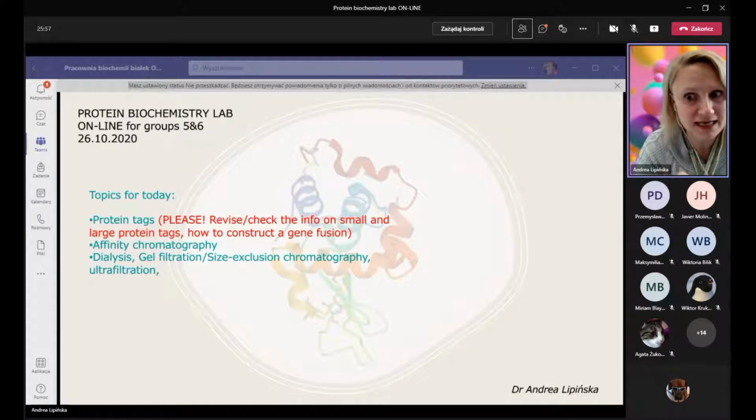But sometimes flexible linkers are not good for a protein to preserve its function, and we use so-called rigid linkers. So linkers which are more solid, they have structure, usually alpha helical structure, and there are known sequences which you can use, like repeats of some motifs, which will form a short alpha helix in between your protein and your tag protein. Okay, so if we clone our CD81 in one of those pGEX vectors, we have thrombin cleavage.